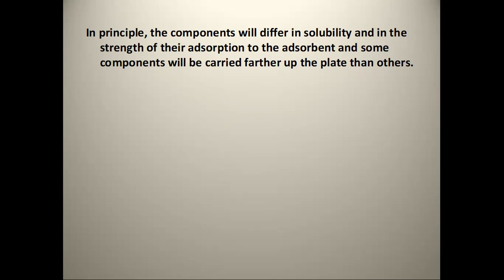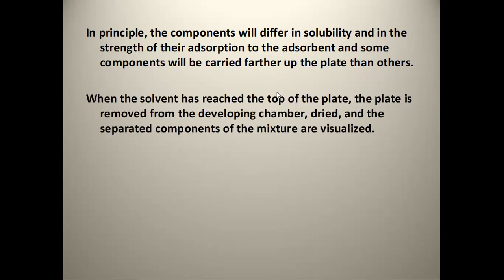So ganun yun. Yung intermolecular forces, dun sa stationary phase at saka mobile phase, nag-interact para kung gaano kabilis yung movement nung mismong molecule na yun. When the solvent has reached the top, the plate is removed from the developing chamber and dried, and the separated components of the mixture are visualized.